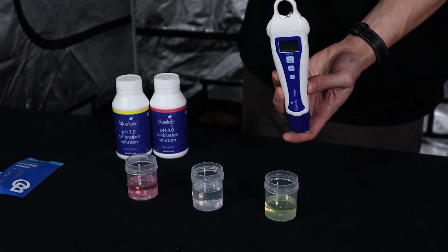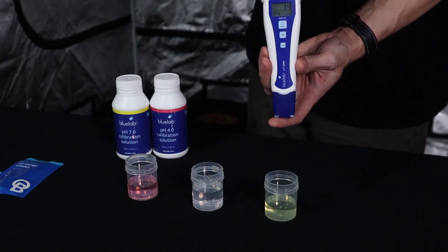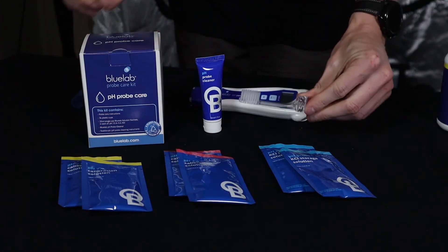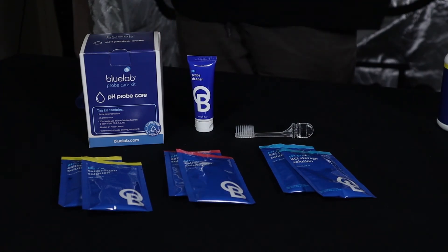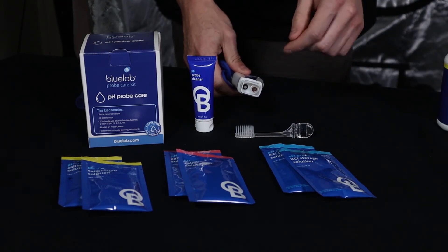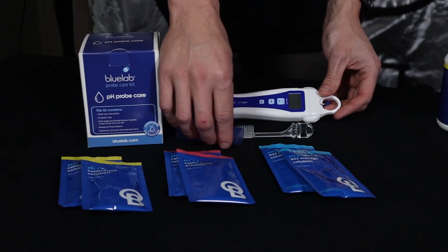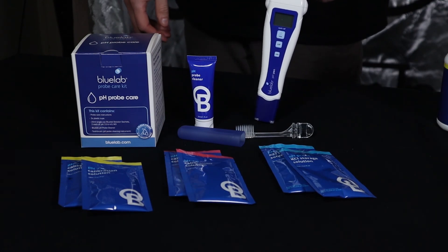There is a battery inside the instrument — two screws at the top to undo, pull it apart, and there's one AAA battery in there. Make sure the screws are nice and tight when reassembling so it remains waterproof, as these are fully submersible. For cleaning, use the little toothbrush from the care kit with a small amount of the probe cleaning solution, and gently swab the glass dome. Give it a rinse, then store it back in the cap or dunk it in KCI storage solution. Keeping the probe hydrated is critical for accurate readings. Hope you've enjoyed this video — if you have any questions, get in touch with us here at Herbal House.